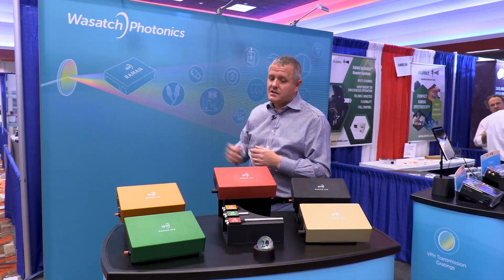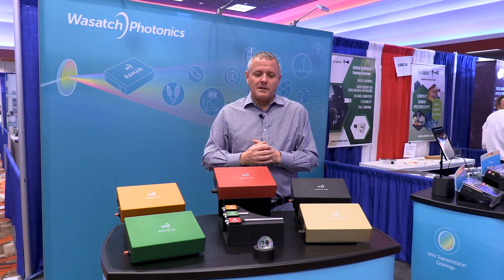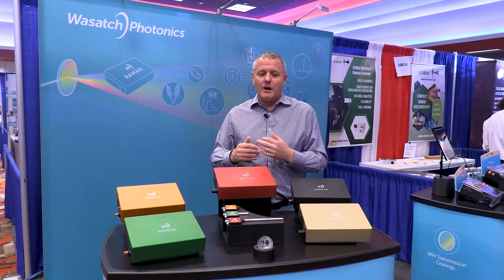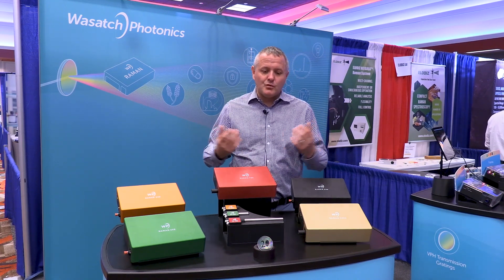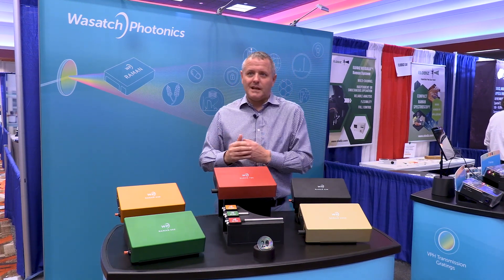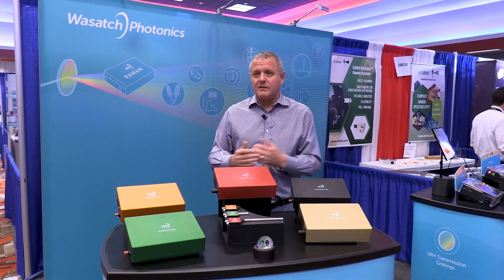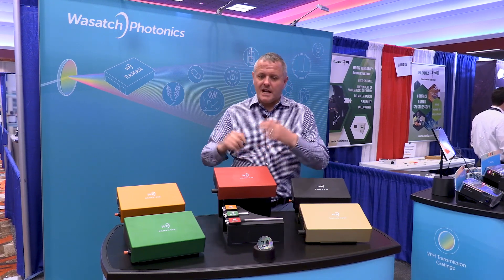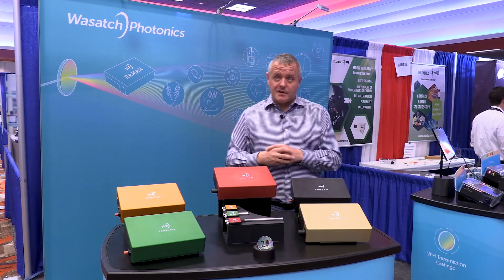At Wasatch, what we wanted to do is design a product line that could really service and facilitate the new age of Raman. Raman traditionally is a white powder measurement — it began in forensic and hazmat, then moved into pharma, which are great worthwhile applications. But the future for Raman we believe is in medical device manufacturing, diagnostics — whether that be cancer detection, disease detection, or antimicrobial resistance. That's where we are and why we designed in line with our strategy.